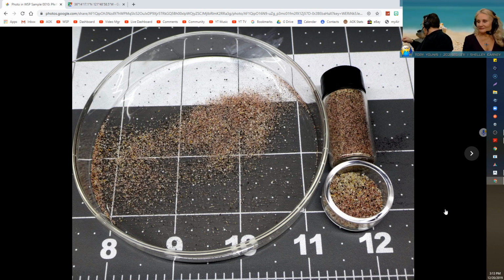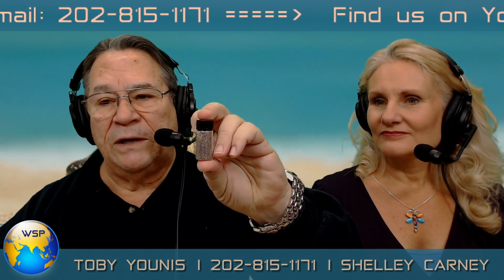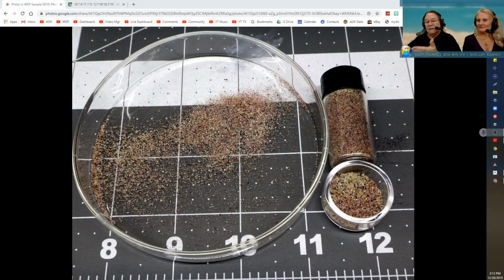Let me go to full screen for just a second. So this is what the sample looks like. That's a 3-gram bottle that we use for our samples. But again, as I tapped it, it separated itself, and you can see the separation as we look at it under the stereo microscope.